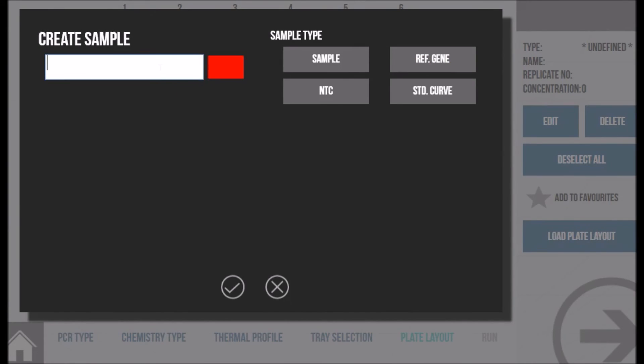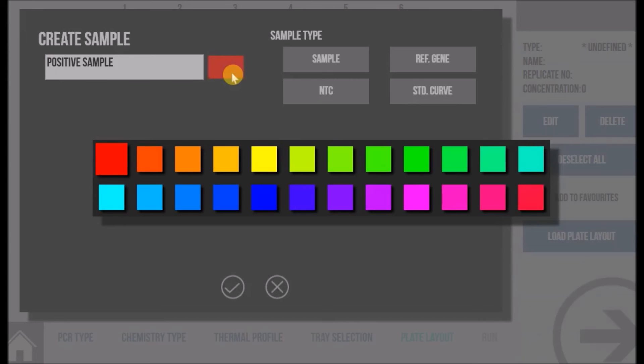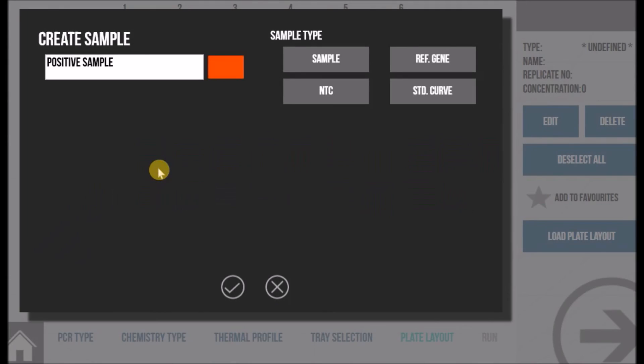You can enter the name here. You can choose a color for your sample, which is the color that it will be displayed in on the amplification graph, and also specify your sample type.